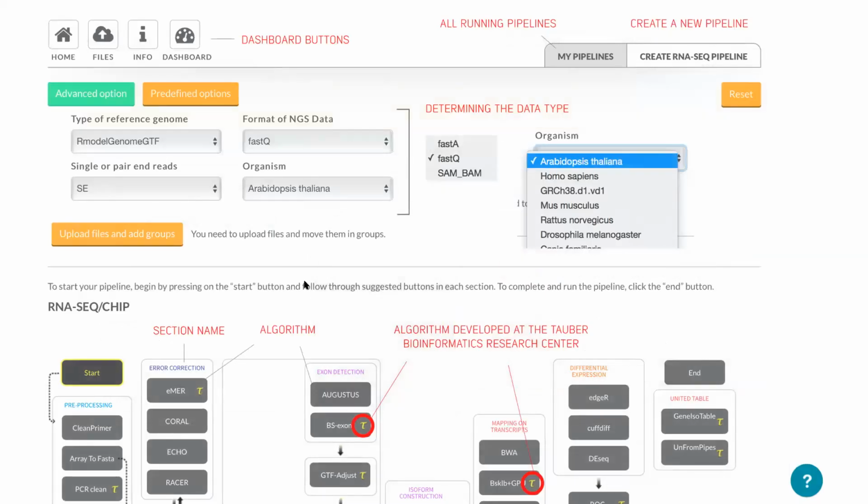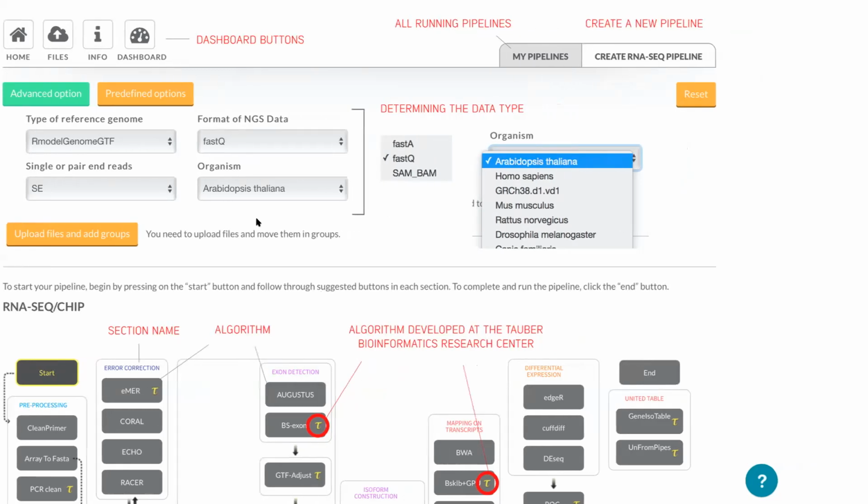On the platform itself, whenever you go to upload the data, you'll have to upload data from the sequencer, but also you will be asked to specify the reference genome. Some of those genomes are already uploaded, and some of those genomes you have to find again on NCBI or another source and upload those there. So we'll talk a little bit more about some of those data formats that you have to take to upload there.